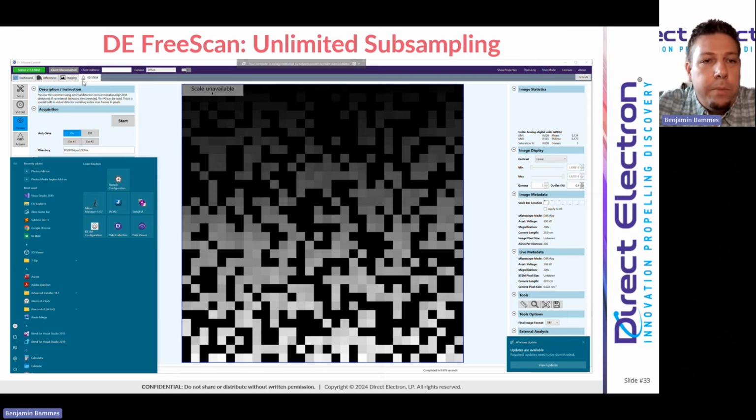This is a random 50% subsampling. I'll play this one more time. And you can see that, again, it's quite easy. It's a single box for selecting the subsampling factor. You tell it if it's random or regular, you click go, and you're ready to go.